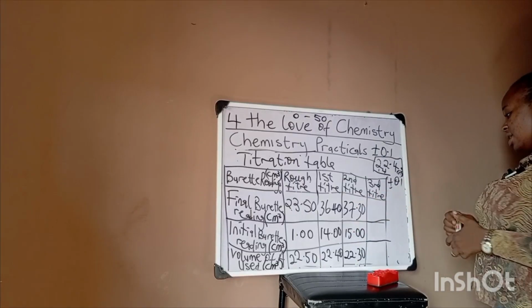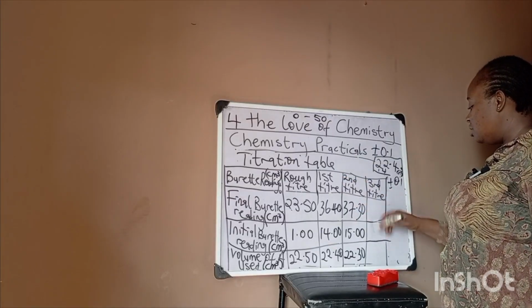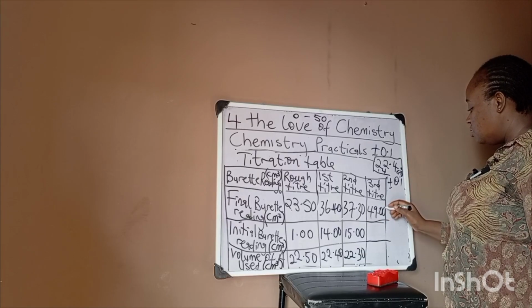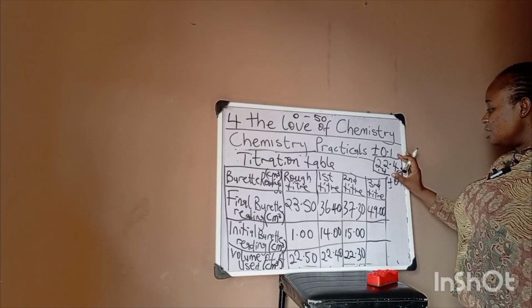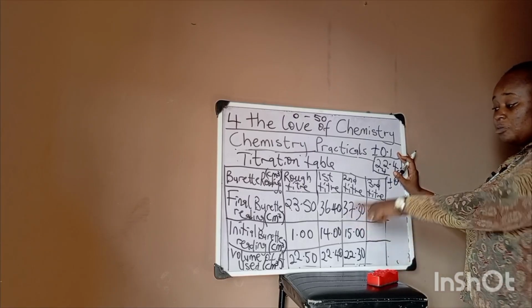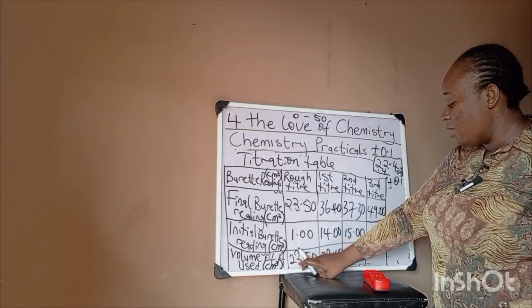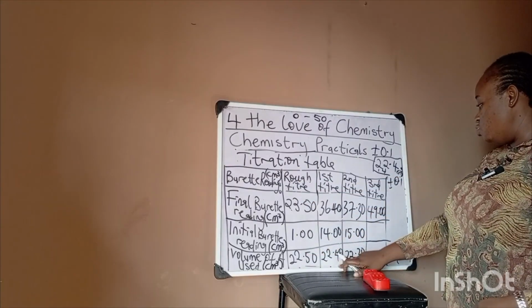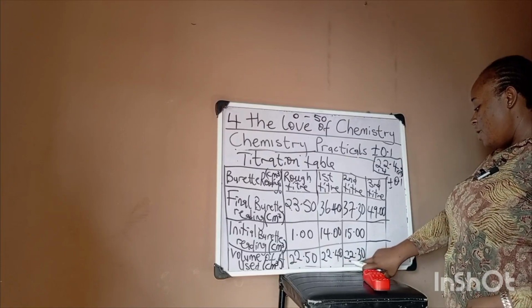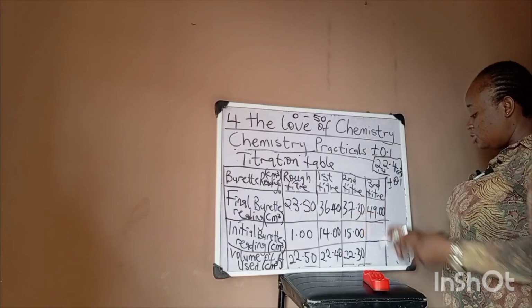So in this one now, we'll choose our final burette reading. Let's say we choose it to be 49.00. Now I already know the volume of acid used that I want, because I'm not going to use rough to calculate. I'm looking at this titre now. I already have the end point and I have minus 0.1. So here I will use plus 0.1.